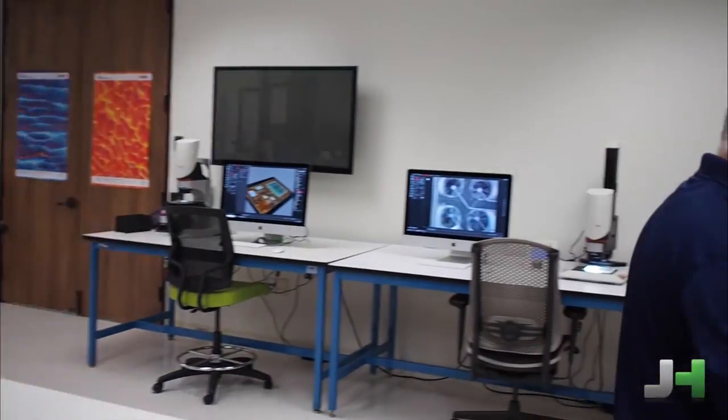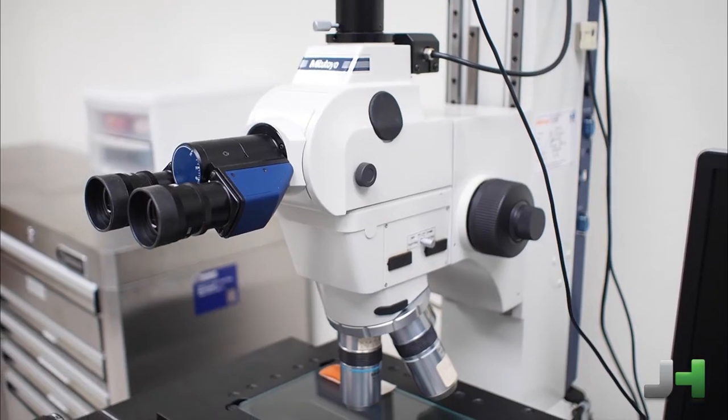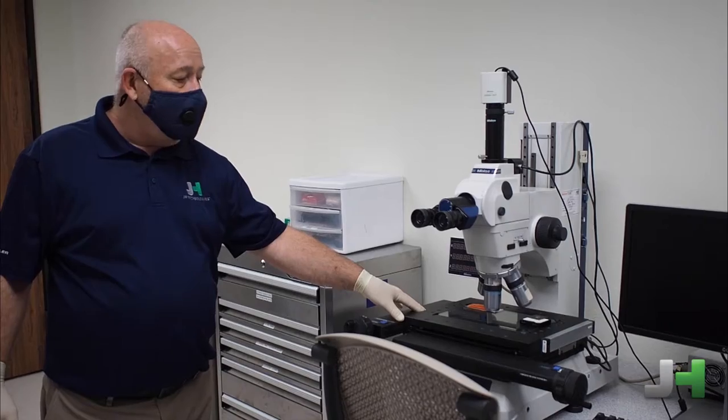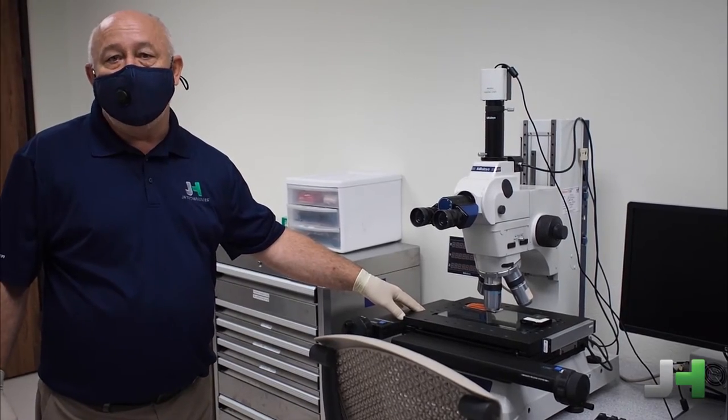As we move through the room, this is a Mitutoyo measuring microscope. We are a distributor for Mitutoyo. So this instrument is here to do high-powered measurements at 1000x optical measurements.